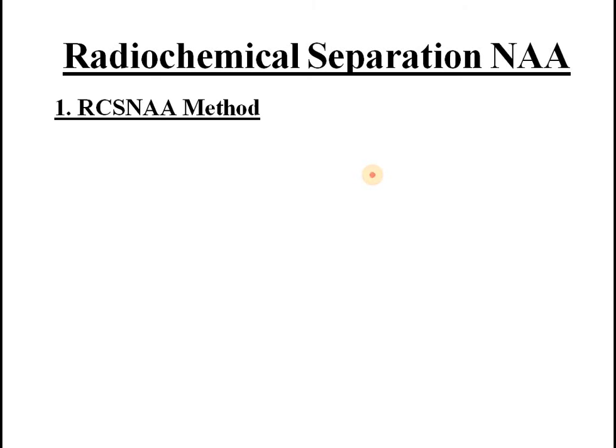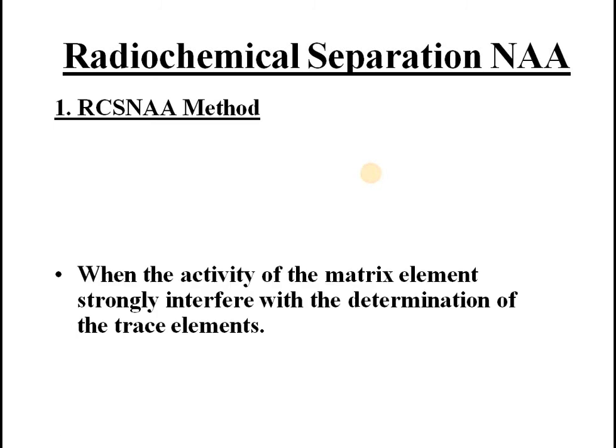Okay, instead if we keep the entire matrix, then what may happen? The emission from the thorium may get absorbed by the matrix, and there will be nothing left for identification in the gamma ray. So the purpose is simply to make the concentration of the element of interest high, in order to increase the concentration of the element.